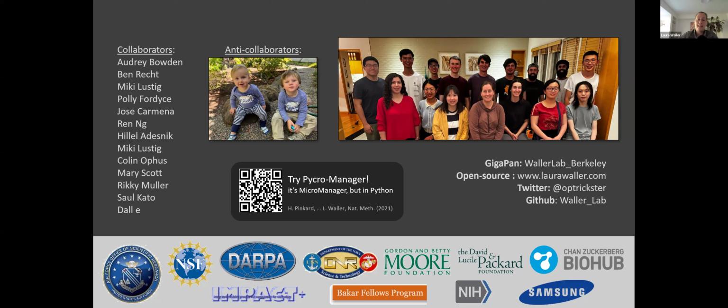We've had biologists get it going many times in the past, and we're very happy to help people if they want to. The structured illumination stuff that I showed at the end with the dynamic samples is totally new, and it just fails for weird reasons. I don't know if somebody could get that up and running easily without some expertise in tweaking the hyperparameters of the neural networks, which I couldn't do, but my students can do. So I don't actually have a good sense of how plug and play that is, but I wouldn't recommend trying that on your own without talking to us first.